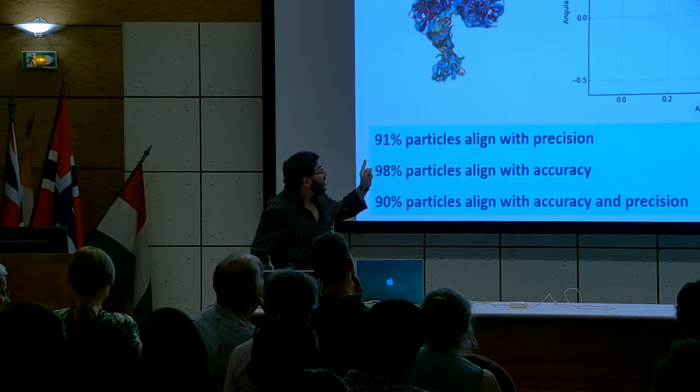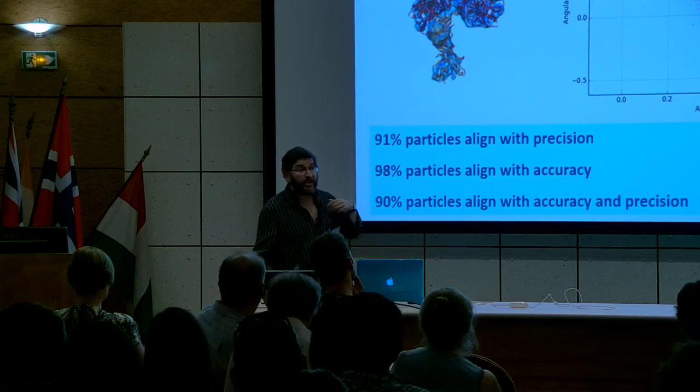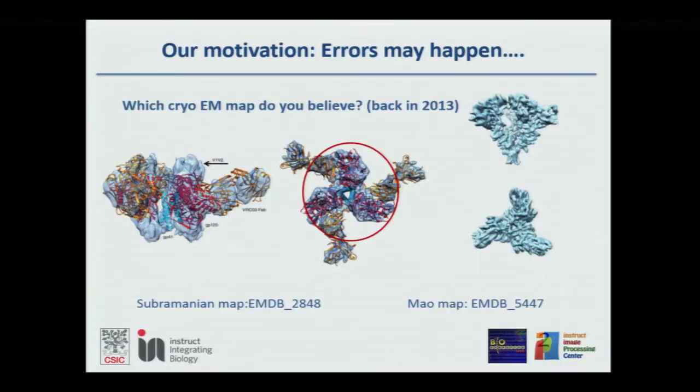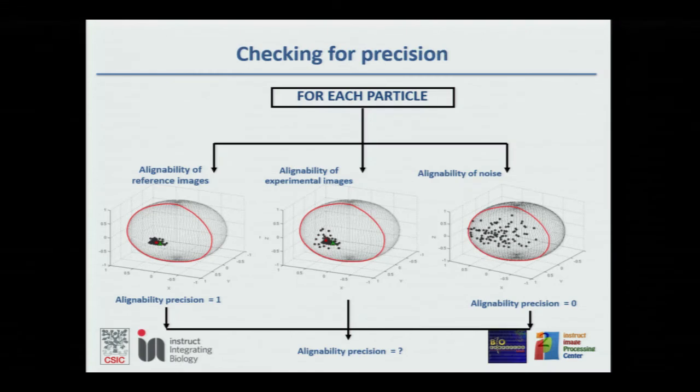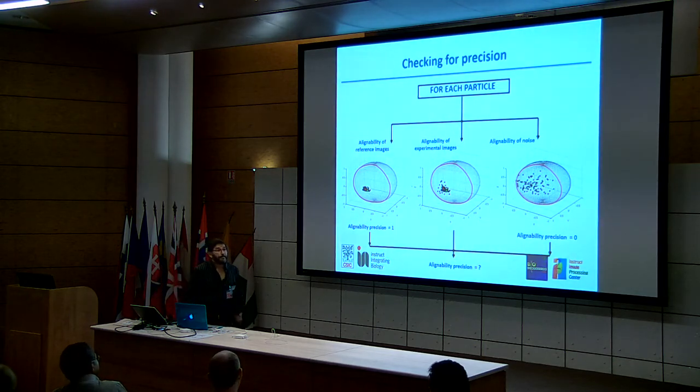And I'm saying this data set is in agreement with that hypothesis, and this data set is not in agreement with that hypothesis. And the hypothesis seems to be relatively simple and logical. At the end of a statistical analysis, if you are in a situation in which your statistical method is telling you very different answers, it does not seem to be a data set from which you can conclude anything.